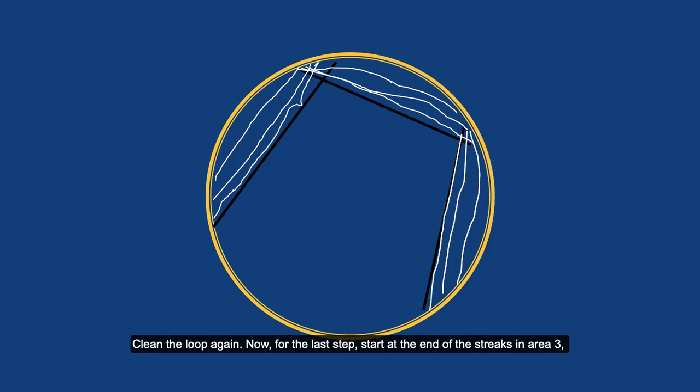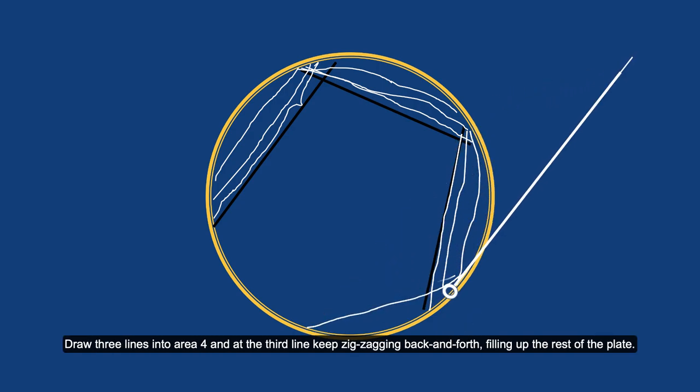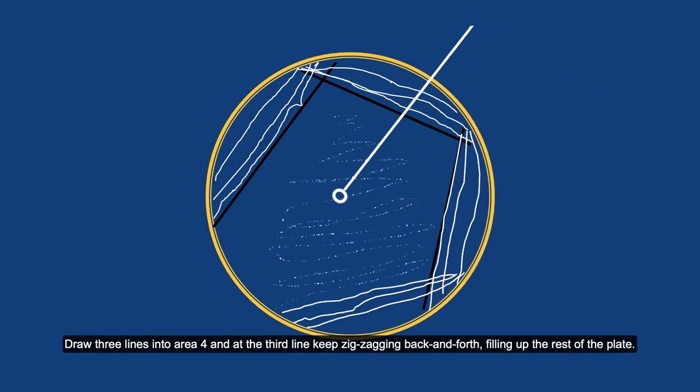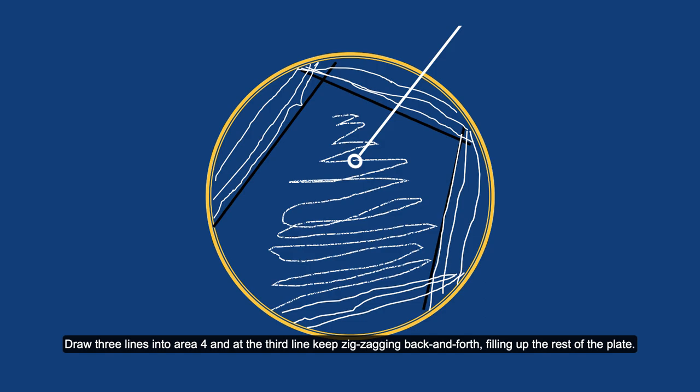Now, for the last step, start at the end of the streaks in area three, draw three lines into area four, and at the third line, keep zigzagging back and forth filling up the rest of the plate.